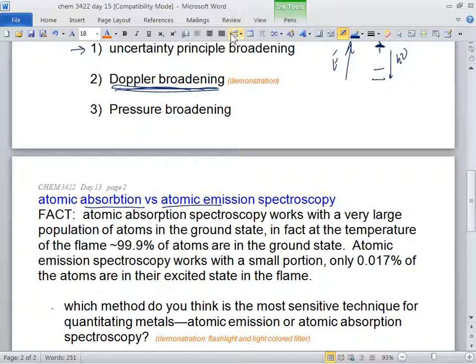The point of that demonstration was to show you background. Which case had a really bright background? The first one. Okay, so now talk about absorption and emission spectroscopy. Which one of those has a really bright background? The first one was absorption because it was absorbing everywhere but yellow. Think of any absorption instruments, those flow diagrams, and how the whole thing works. Does that have a really bright background or a really dark background? Absorption.